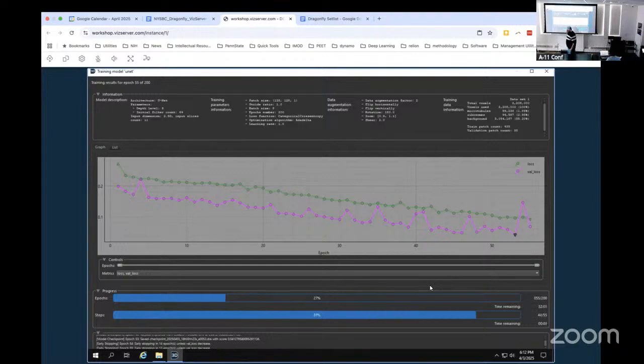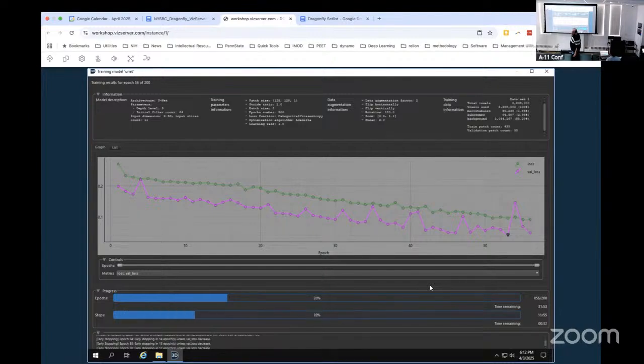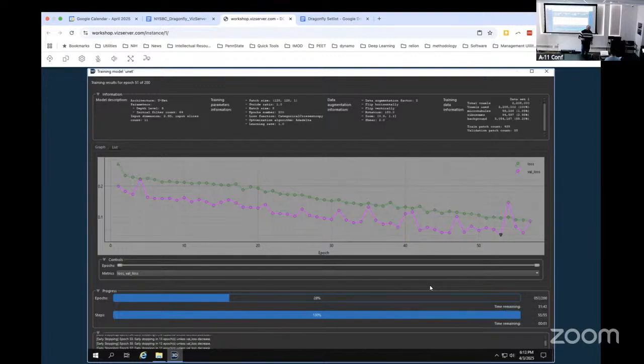If you use another software like AIS, I know they have a UNet, they have similar methods. Would the output be comparable, or does Dragonfly do something different?